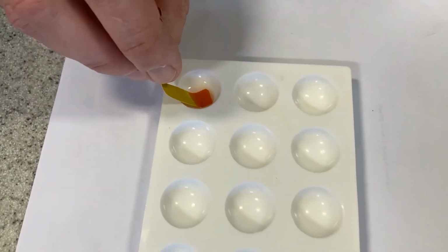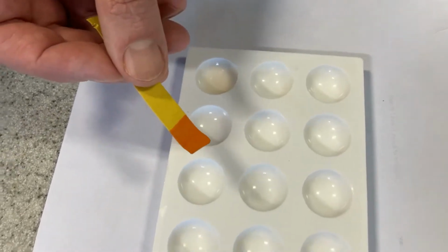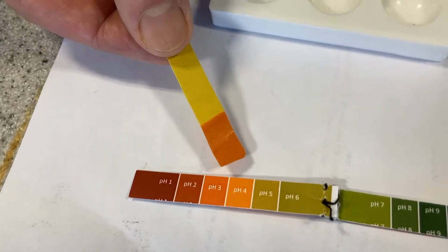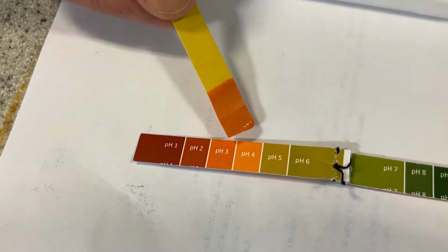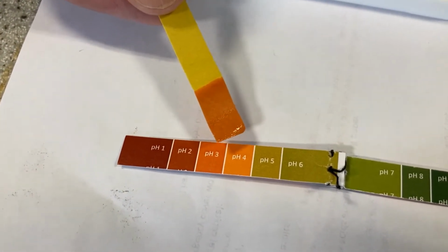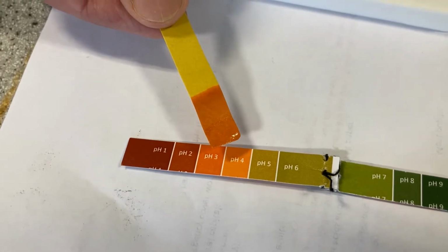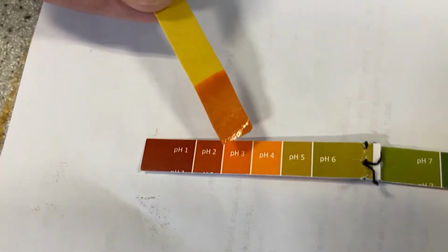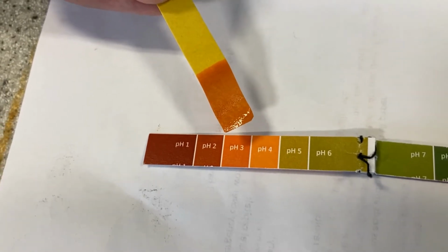Wow, see that straight away? That has gone a red colour. That was vinegar. So that's telling us that is roughly a pH 3 or 4, which is quite strong acid. So that's quite a strong acid.